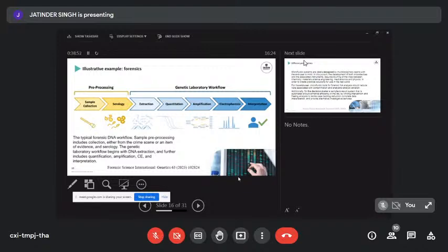They collect the sample, look at serologies, look what it is: is it semen, is it blood, is it tears, is it just rainwater? There's some pre-processing taking place where the microfluidic device won't have any influence. After that, an extract of whatever samples they collected makes it to a genetic laboratory, which then gets us to the workflow we'd like to implement on the microfluidic device.